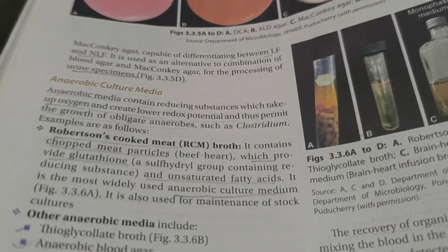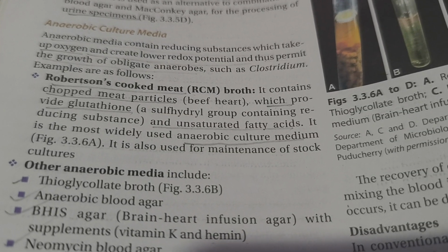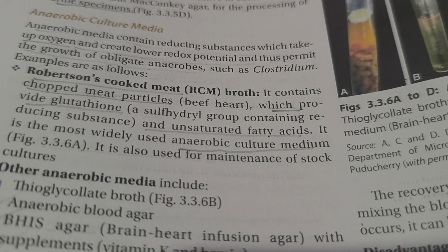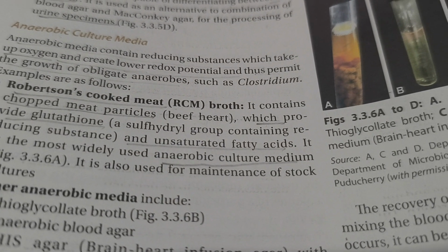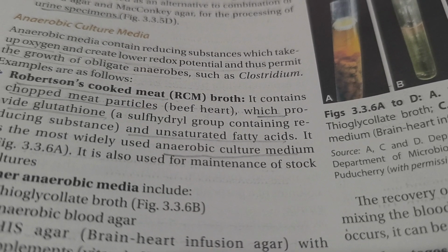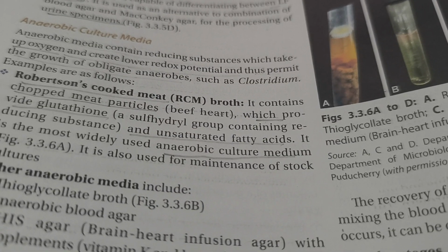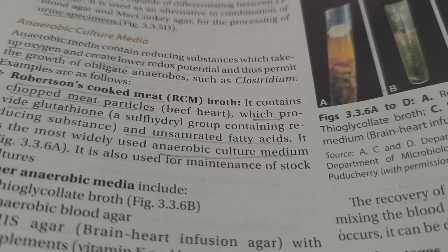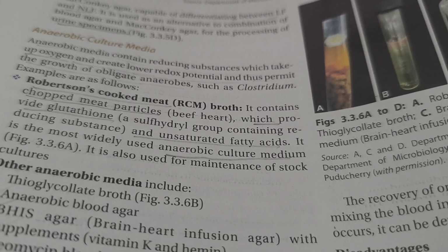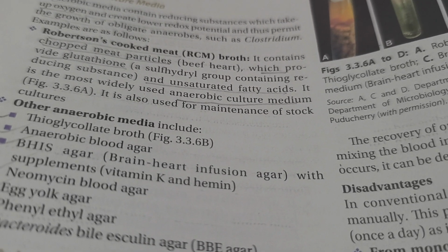Let us see anaerobic culture media. Anaerobic culture media contain reducing substances which take up oxygen and create lower redox potentials and thus permit the growth of obligate anaerobes such as Clostridium. Examples are as follows: Robertson cooked meat broth.